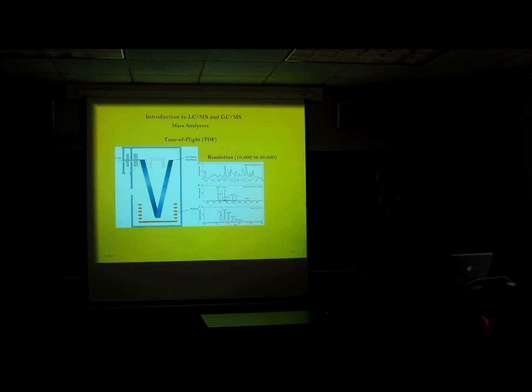The problem with that is if you have high efficiency separations, either GC or LC, where you have a good chromatographic peak that's only a second wide, and your duty cycle on your mass spec is one mass spectrum every 3 seconds, you're not going to get a lot of points across the peak. You're not going to have a nice Gaussian detection peak. You're not going to be able to do as accurate a quantitation.